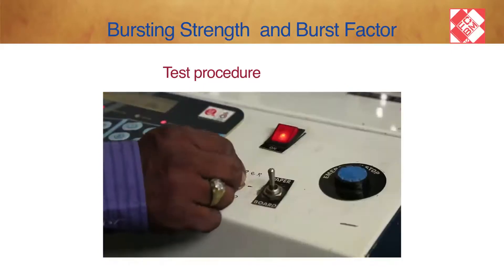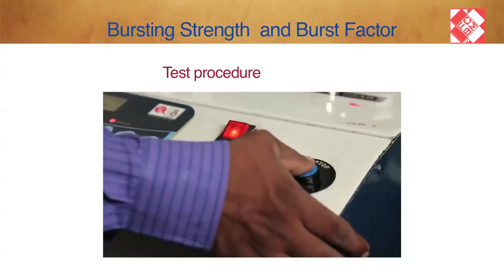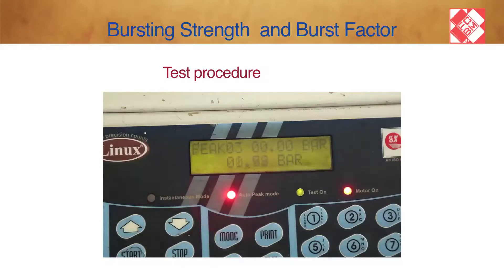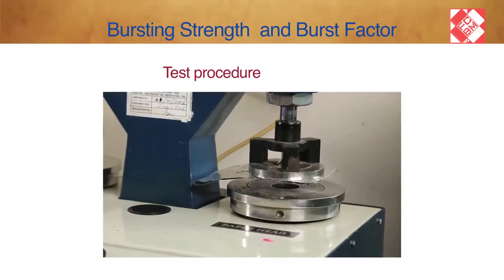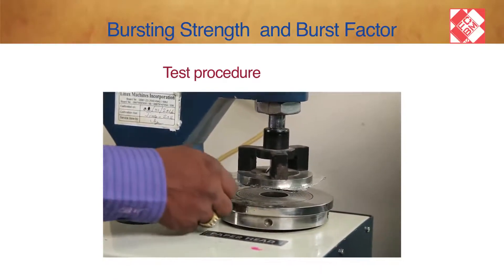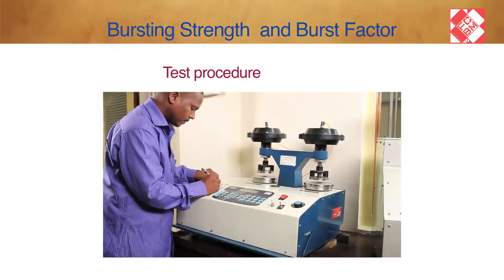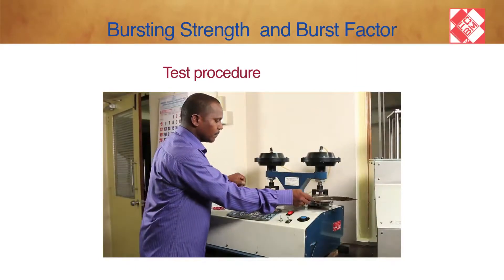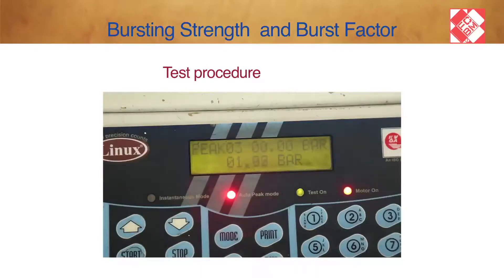Lower the clamping plate by pressing the button down. The first test on a new sample should always be done with the gauge of greater range: 0 to 120 pounds per square inch. Make sure that the valve to this gauge is open and the valve to the other gauge, 0 to 30 pounds per square inch, is closed. Record the bursting pressure indicated by the digital display on the equipment.